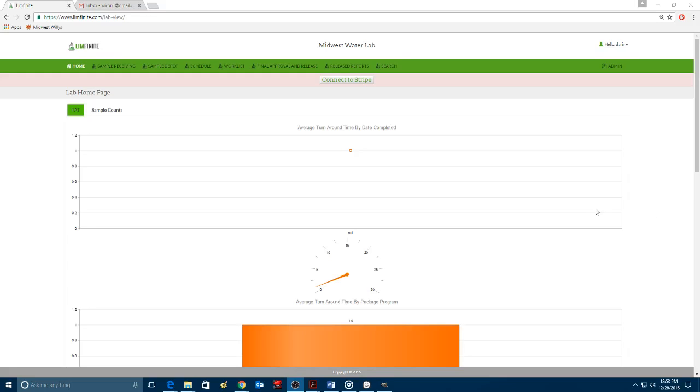In this video, I'm going to create a run of samples so that I can enter sample analysis results. What I've already done is I've created the samples in this LIMS system, and then I've marked the samples as prepped, and then I've also prioritized the samples. I've prioritized these samples as high priority, which means rush.